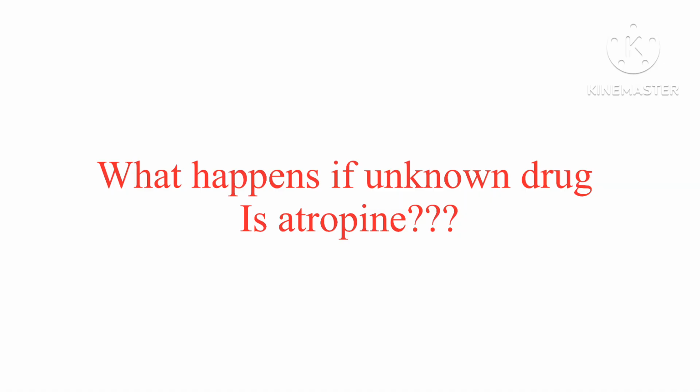What happens if the unknown drug is atropine, not adrenaline? Then atropine's effect is not blocked by propranolol because atropine works on muscarinic receptors and propranolol works on beta receptors.